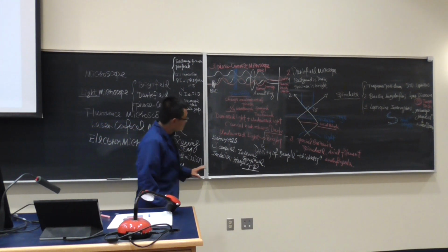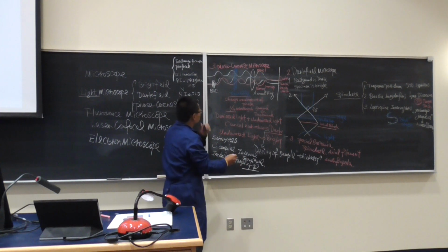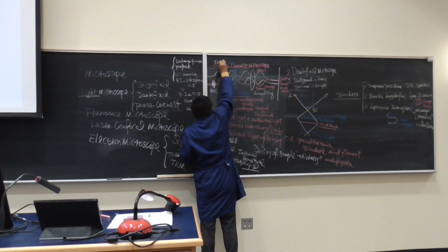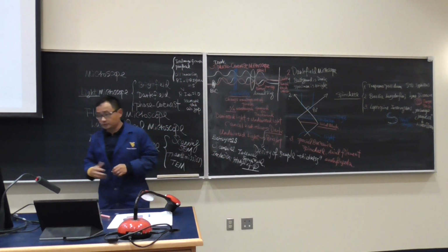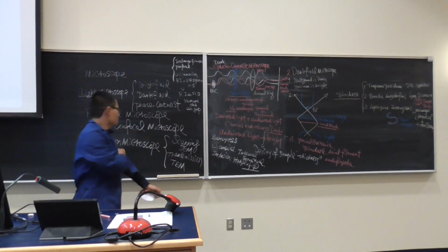Now, because the sample is dark, some people also call the phase contrast microscope the dark phase contrast microscope. So that's a story. Okay, fluorescence microscope.